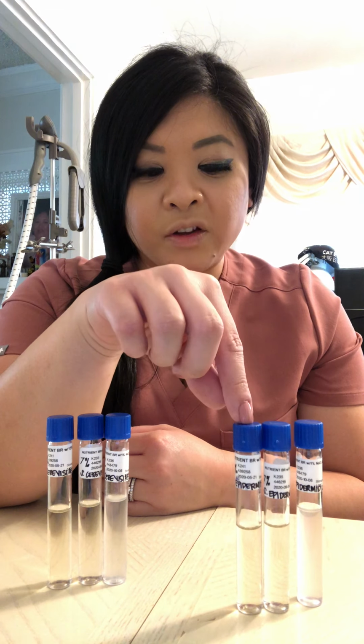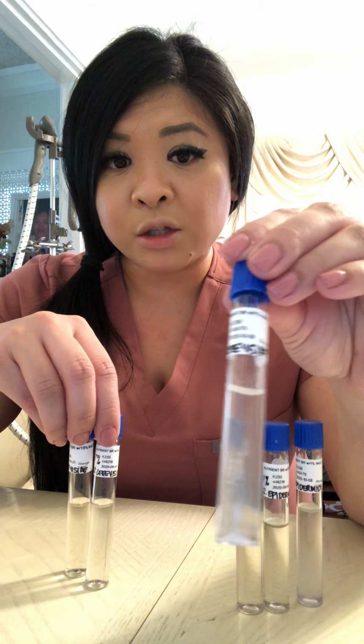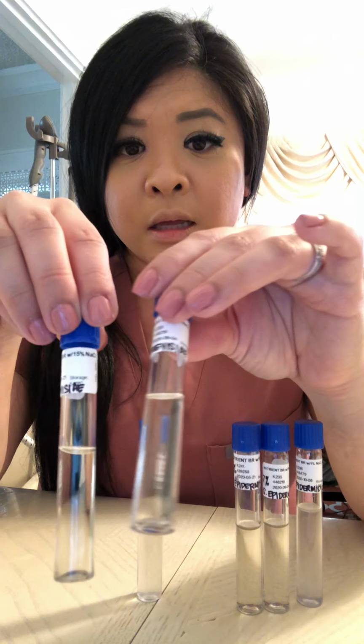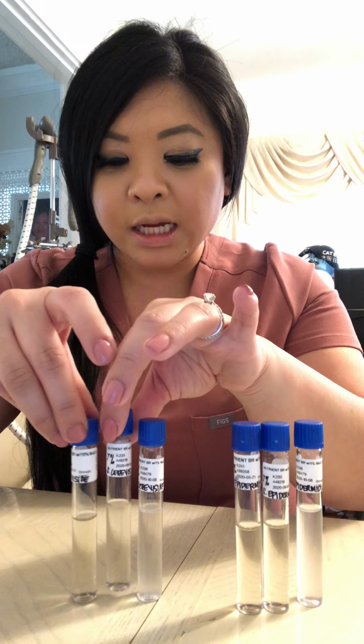I did find that interesting because S. epidermidis grows on the skin and in very salty and warm environments, so it was interesting that the 7% and the 15% came back negative. My S. cerevisiae are also interesting because the 1% came back turbid, and the 7% and the 15% are clear, which is negative.